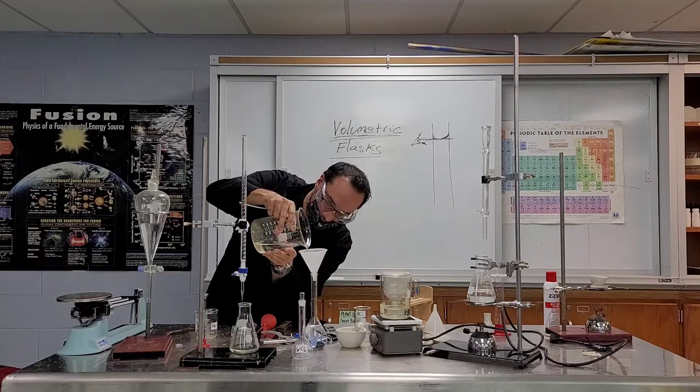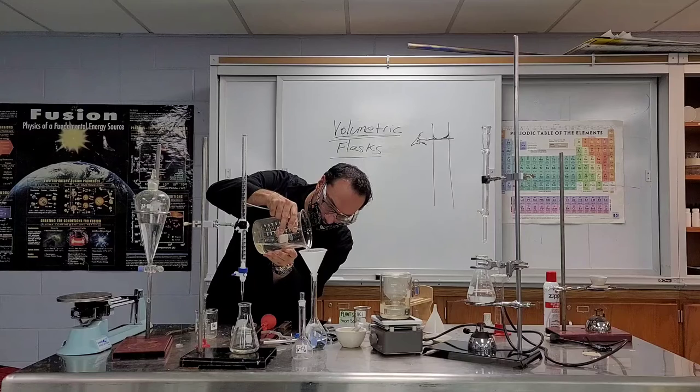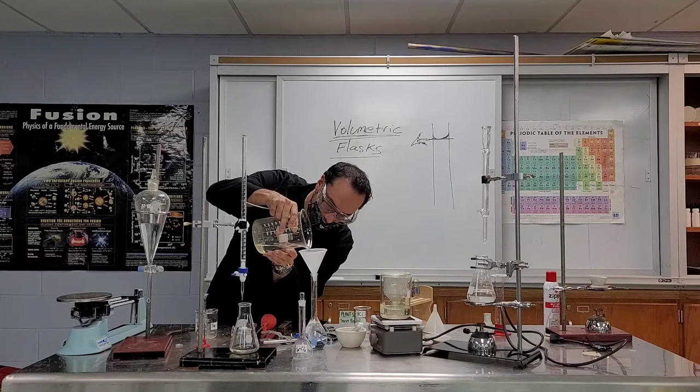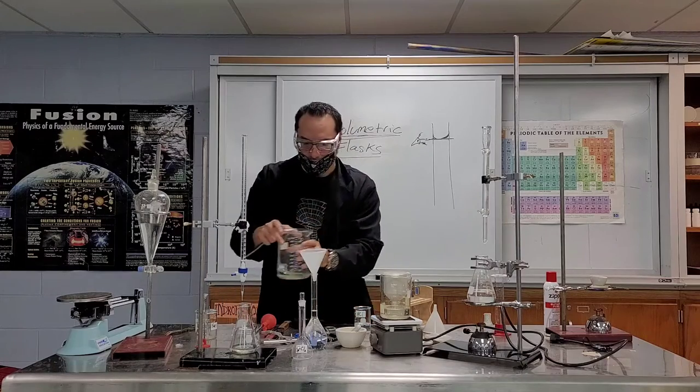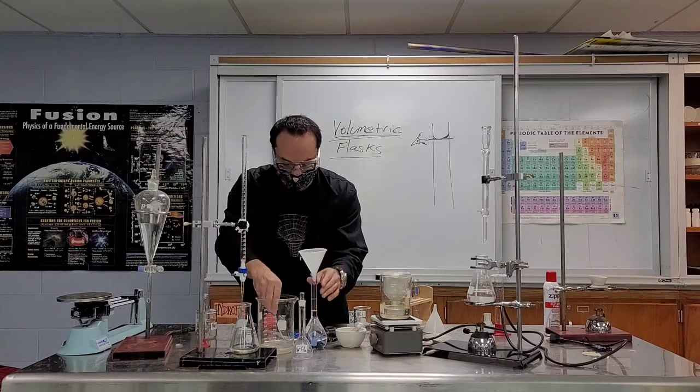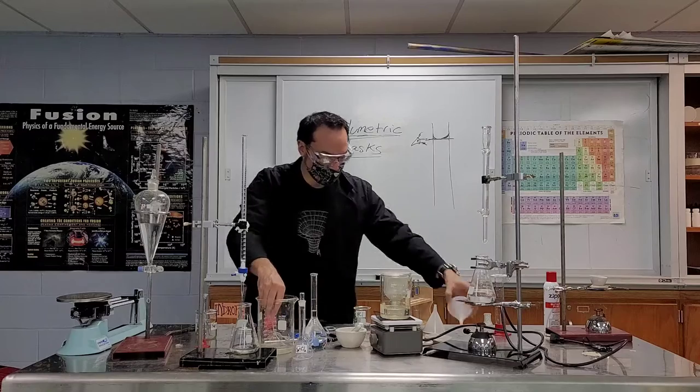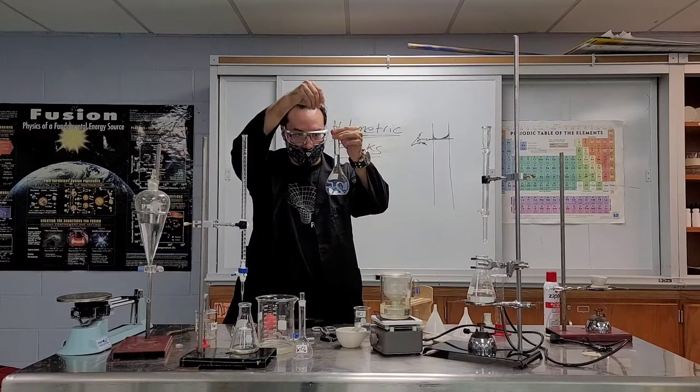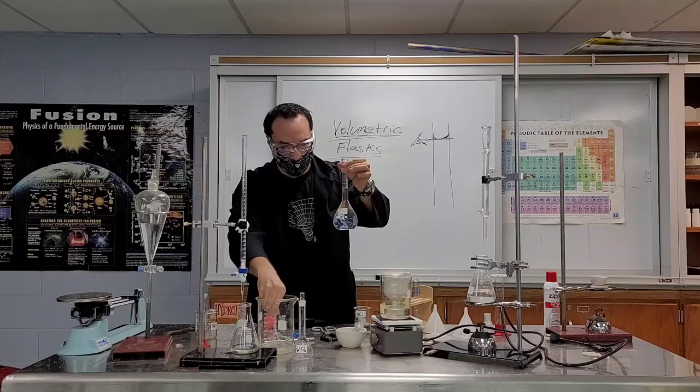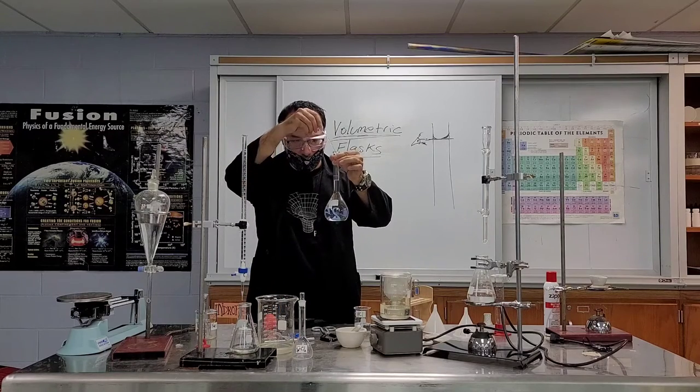What you want to do is really carefully get close to the line. All right, way too close. Then what you do is finish off by adding carefully like this. All right, and the same goes for the small one over there.